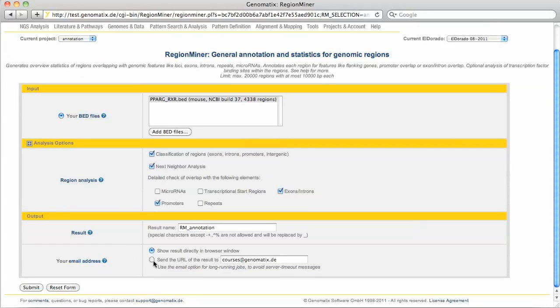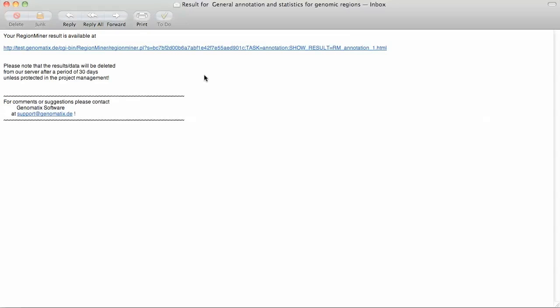This analysis will take some time so I'll let the system send me an email with a link to the result when it's ready. Now here's the link to my result.